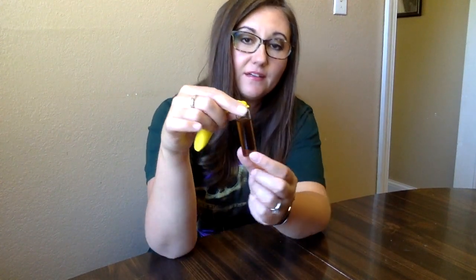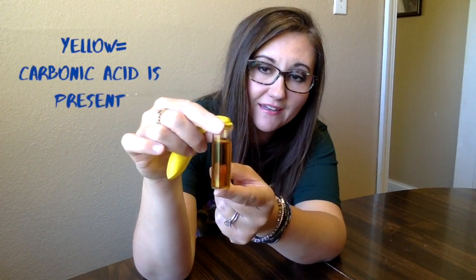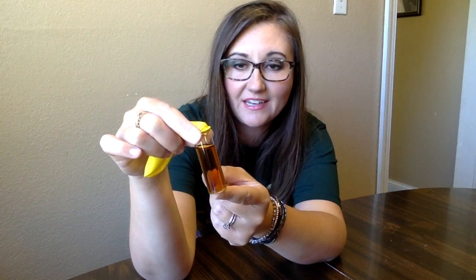So let's take a look at our little experiment with the bromothymol blue indicator and see if carbon dioxide was able to get into our water to create carbonic acid. And look, it used to be really dark blue. Now it's a kind of dark yellow orange color, and that shows that that worked. Okay, so pretty cool little experiment with a chemical indicator. So that proves that what came out of the chalk was indeed carbon dioxide.